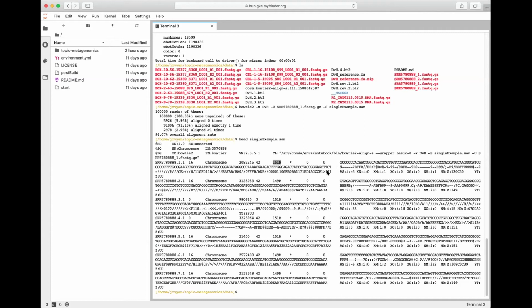So all of these weird random symbols, they represent the quality of the read, and that's because quality in FASTQ files is not on a decimal base. It's represented by all sorts of symbols that represent numbers between 0 and 93, if I'm not mistaken. So each one of these really represents a number between 0 and 93. And that tells you what the quality of the reads are, or it tells Bowtie anyway. So this is what a SAM file looks like.